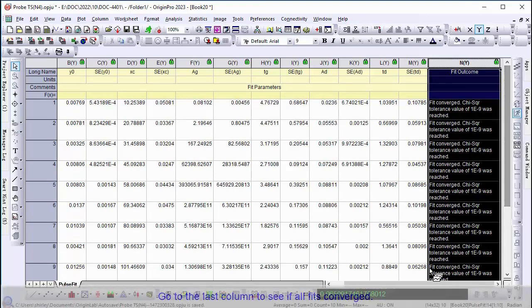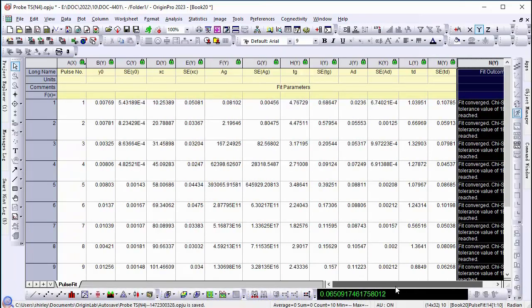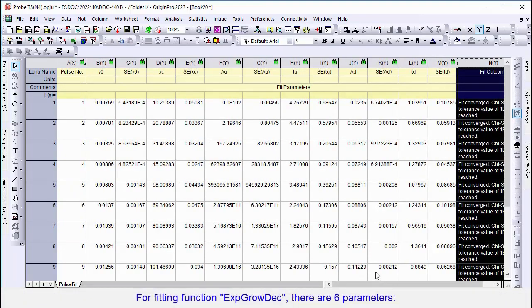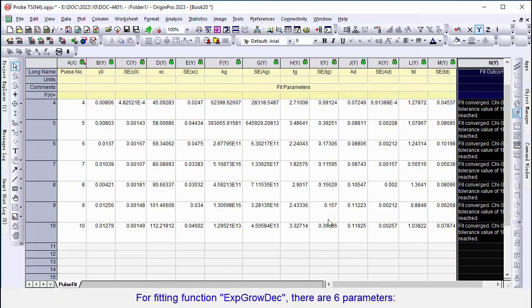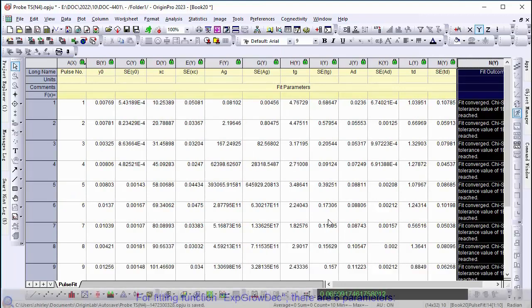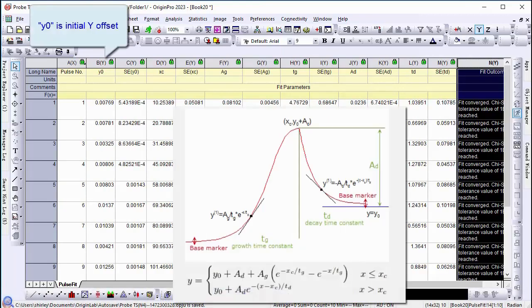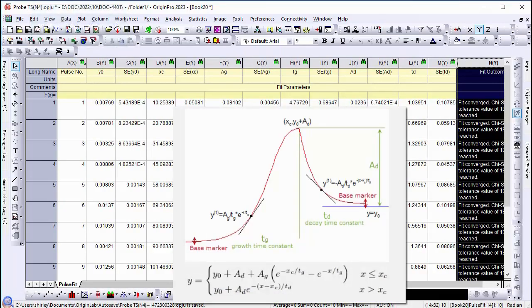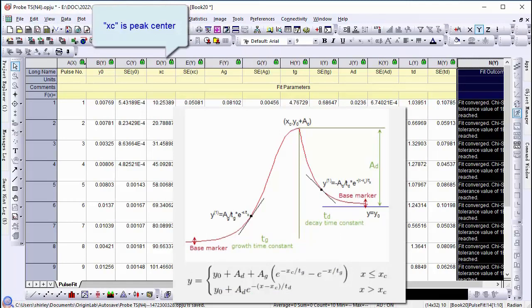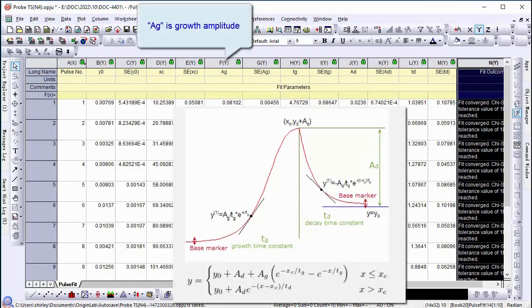For the fitting function Exponential Growth Decay, there are six parameters. y0 is offset, xc is center, and ag is growth amplitude.